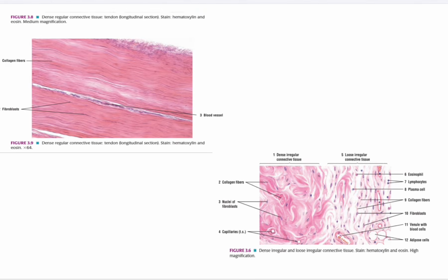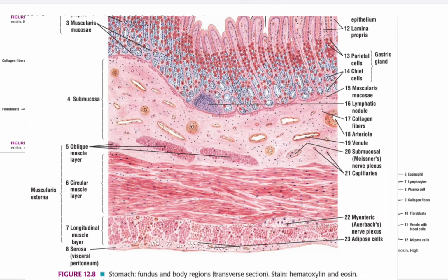But finally, you should also consider which tissue you are looking at. For example, in the alimentary canal, you will find smooth muscle along the wall. So in the stomach, you will find the oblique muscle, the longitudinal muscle and the circular muscle, and in the rest of the alimentary tract you will find the longitudinal and the circular muscles.